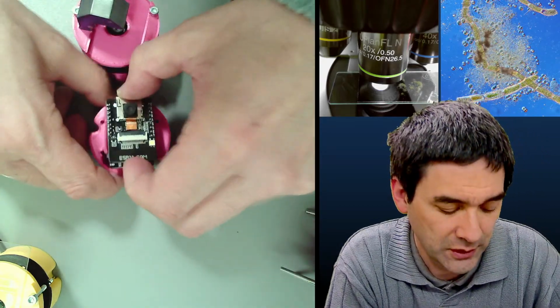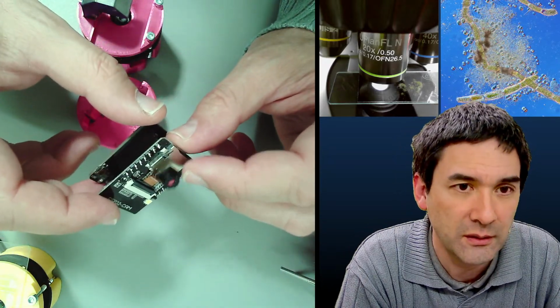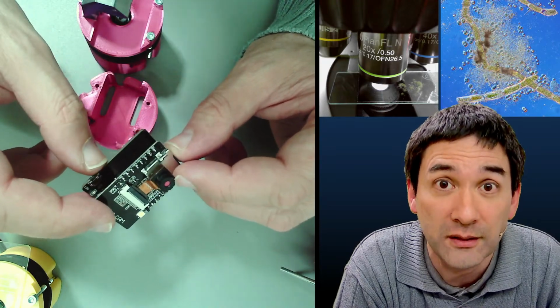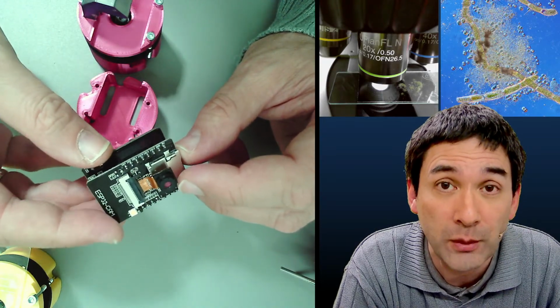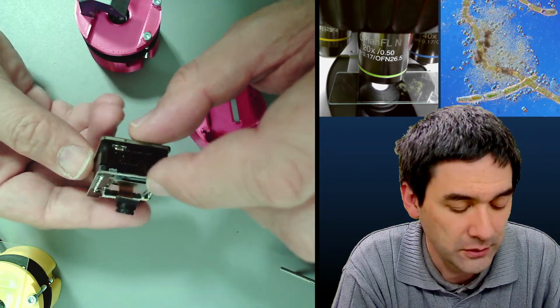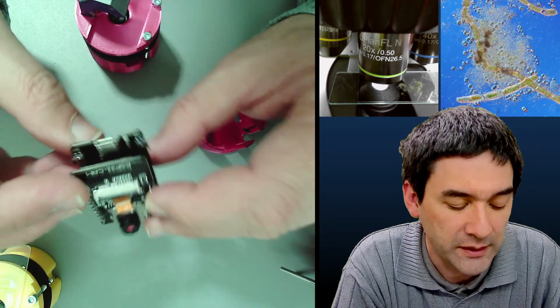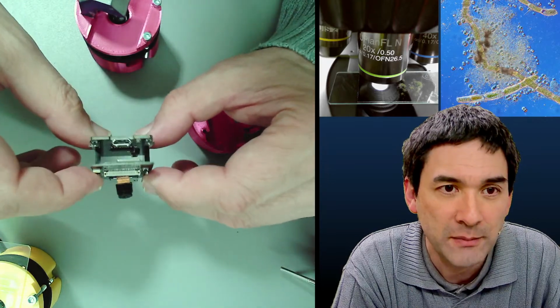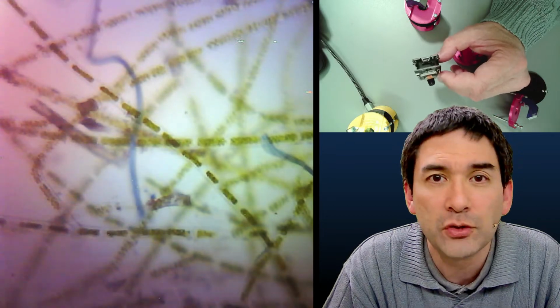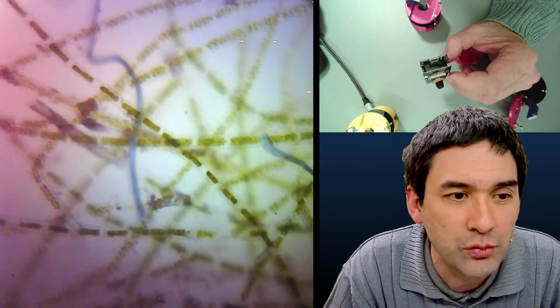Let's take this out here, maybe it's easier. So this is the camera. It's 1600 by 1200 pixels, which is a pretty decent camera. There is an SD card slot here, which I don't need, and there is Bluetooth and wireless transmission, so the picture is transmitted wirelessly. For example, the picture that you see here is transmitted wirelessly to my computer, and then I included it into the streaming software.